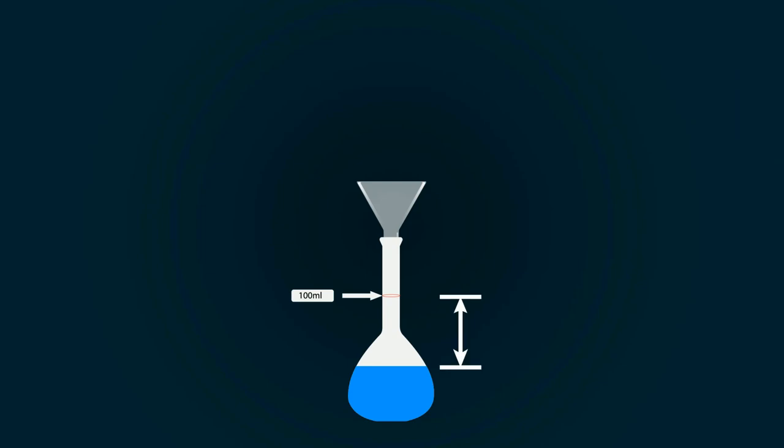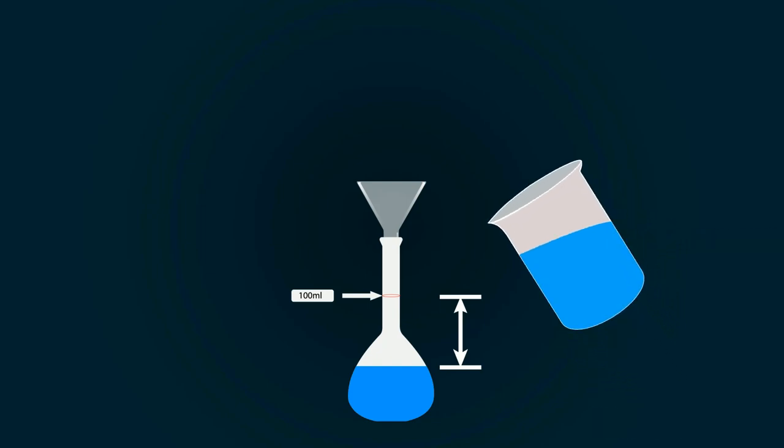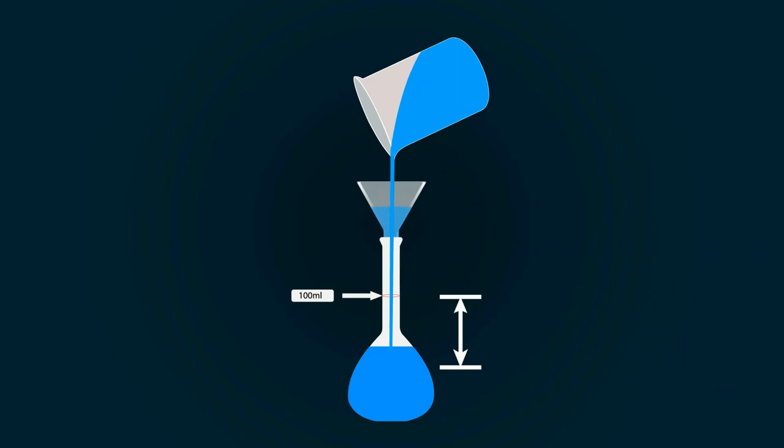For that you have to add more ethanol in it. So take some more ethanol into an empty beaker and start pouring it into the measuring flask to fill it up to the 100ml point.